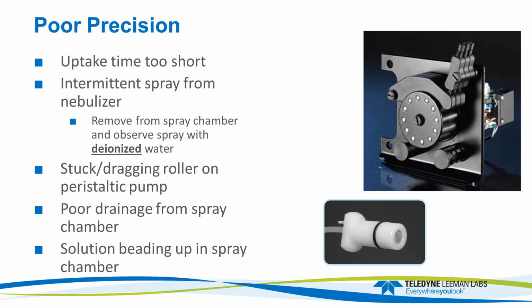Right? You don't want acid getting all over that. If you have seen some of the peristaltic pumps that we see sometimes when we go in the field that have just been really abused, because people don't change the tubing, they just wait till it breaks and get acid all over the place. If you take care of these things, they'll last a long time.